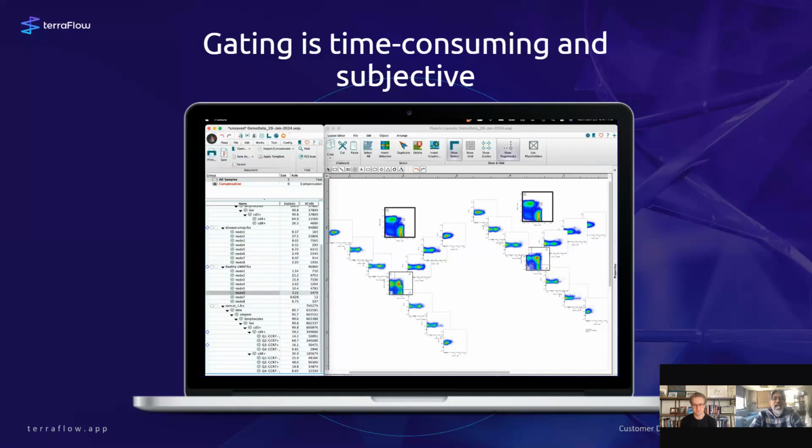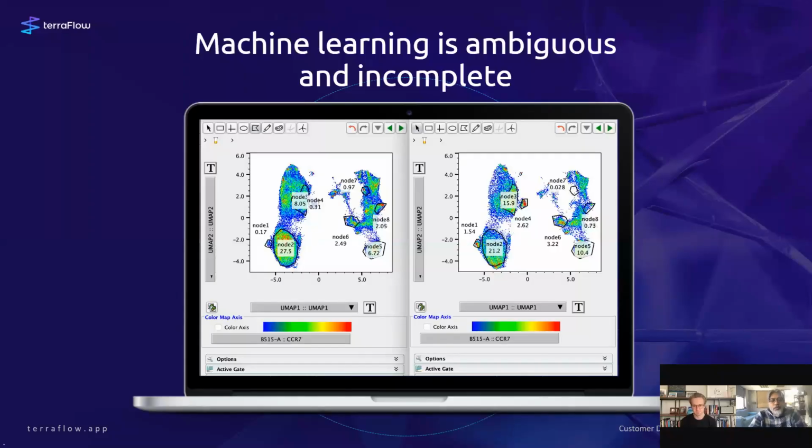We're not going to talk about those approaches in depth today, but more importantly, what we're going to talk about is how we can actually access all of the types of cells that are present in your data set. And one way that people approach this right now is that they do machine learning, or they use these visualizations that essentially cluster cells into groups. And so you'll find that there are different islands in these UMAP and t-SNE plots that people commonly present. But the problem is, again, it's really subjective what a real island is, what a real cell population is.